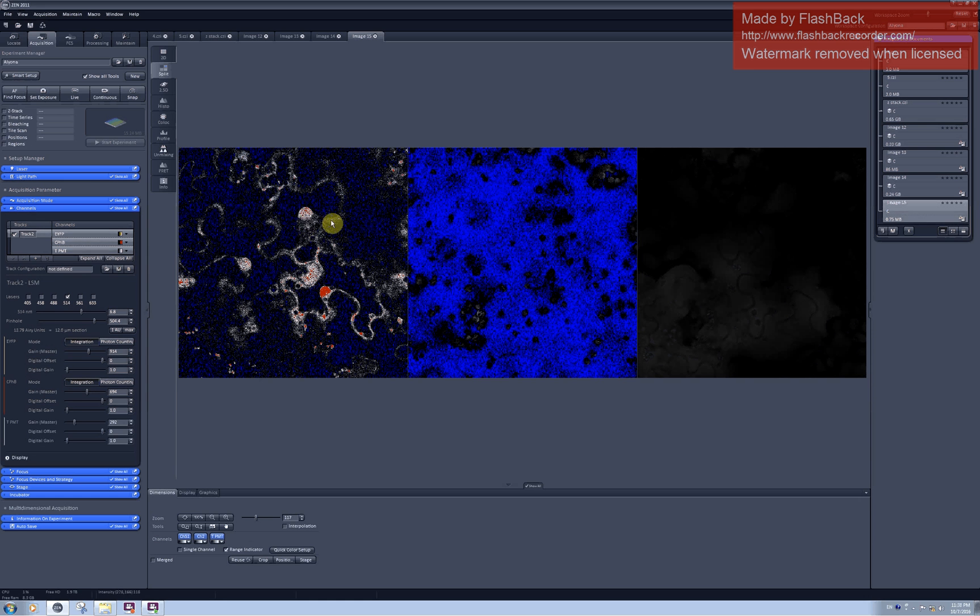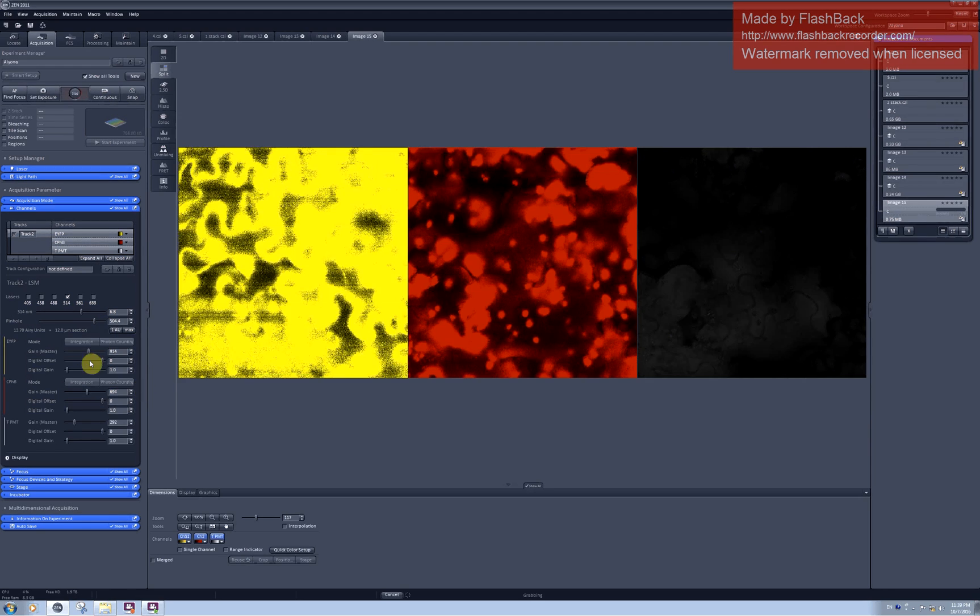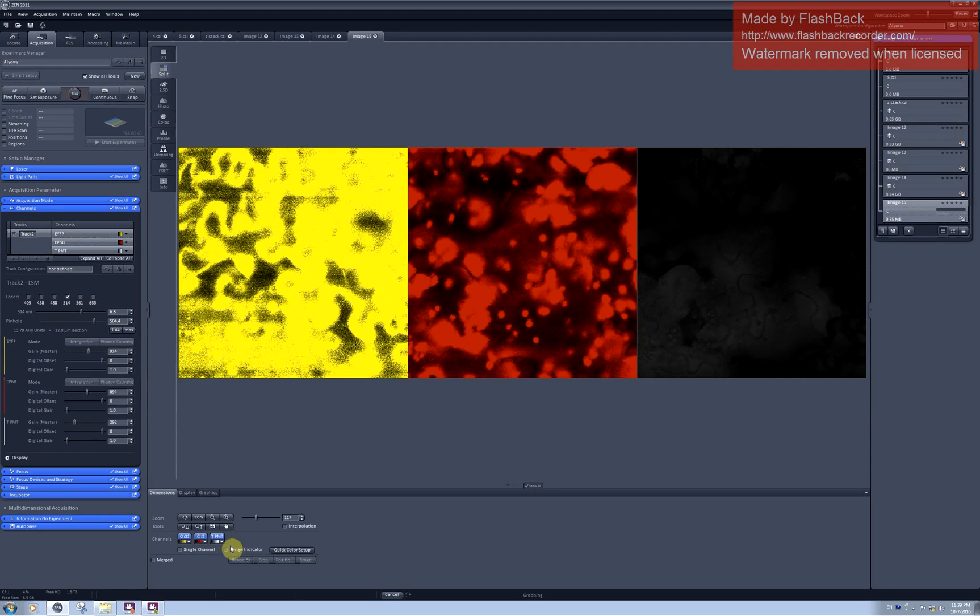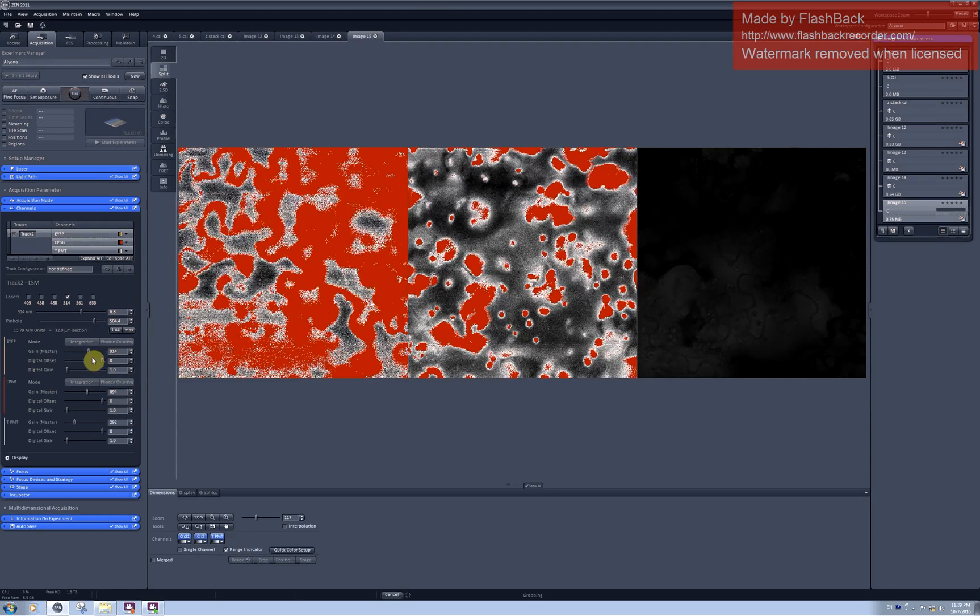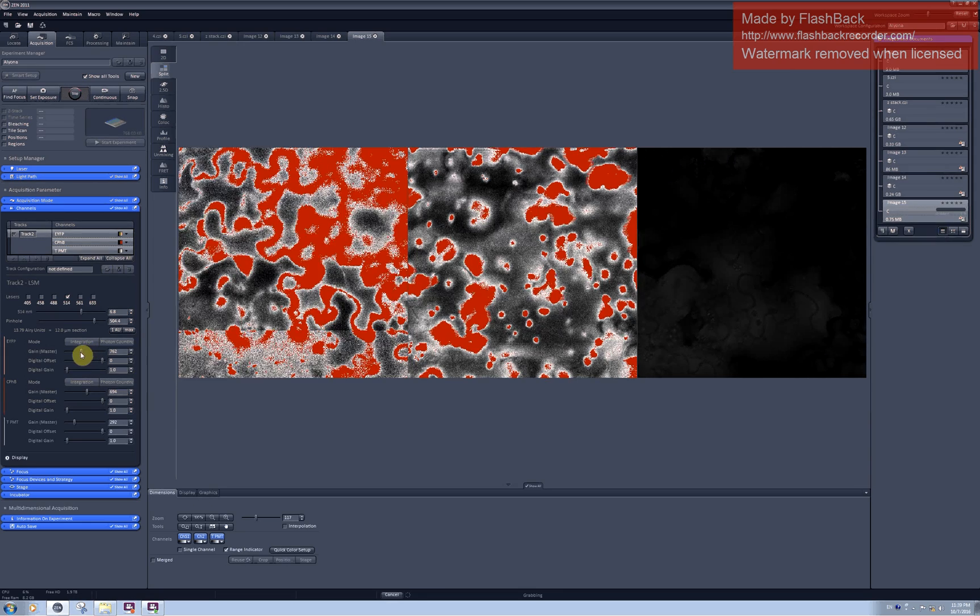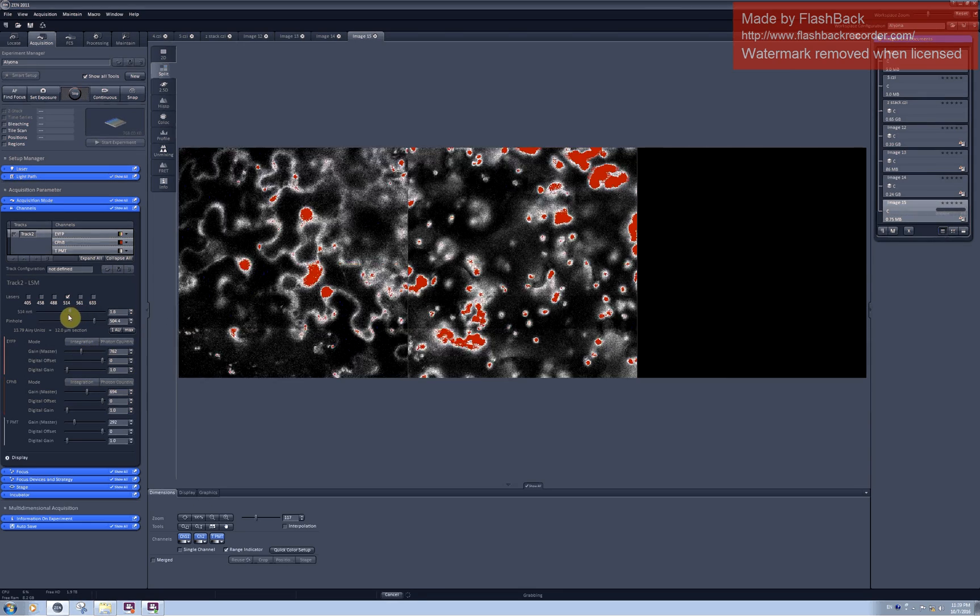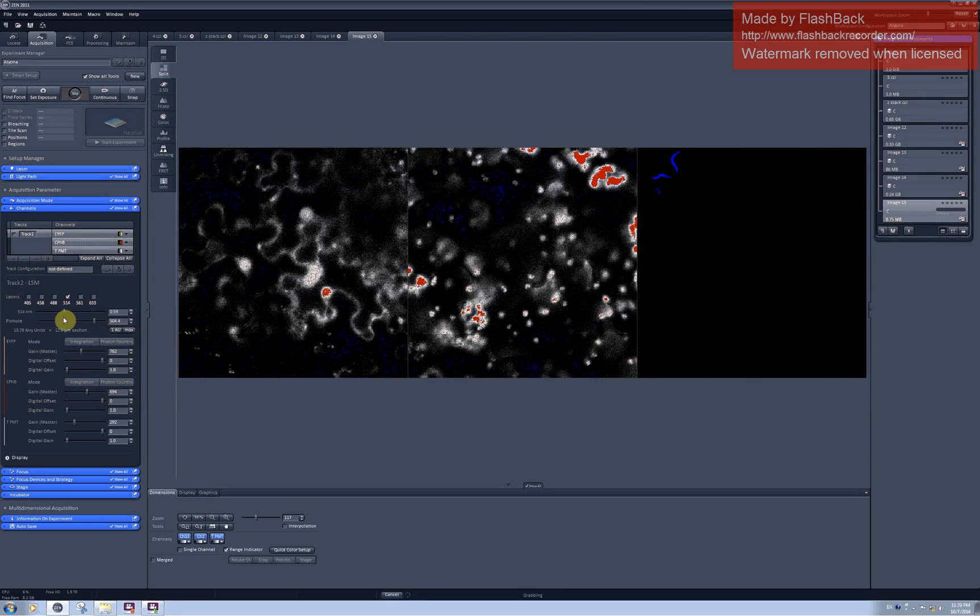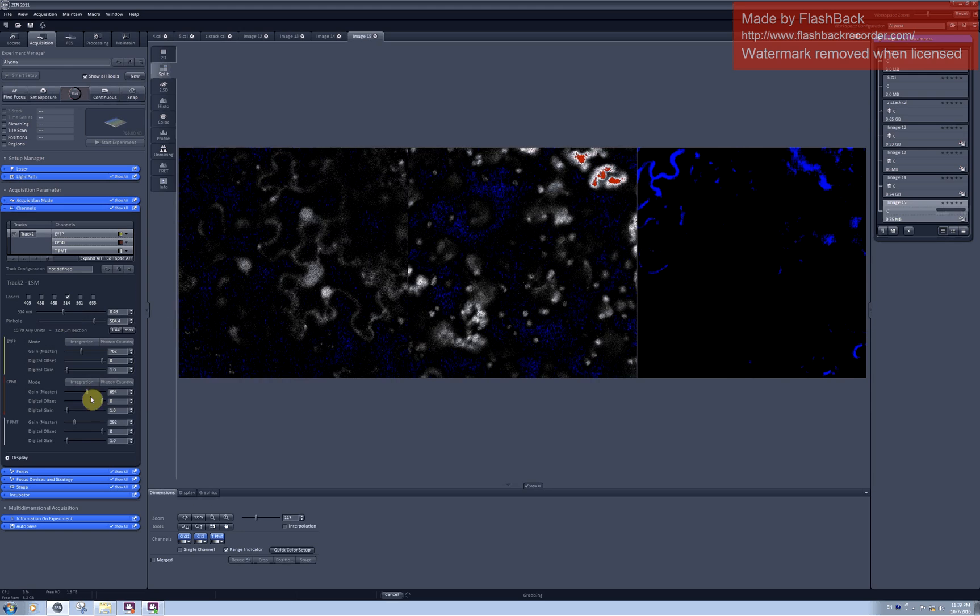And as you can see I have quite a lot of red pixels here already. And I even opened the pinhole additionally. So this needs to be adjusted. I need to decrease the master gain and the laser intensity to get rid of the red pixels.